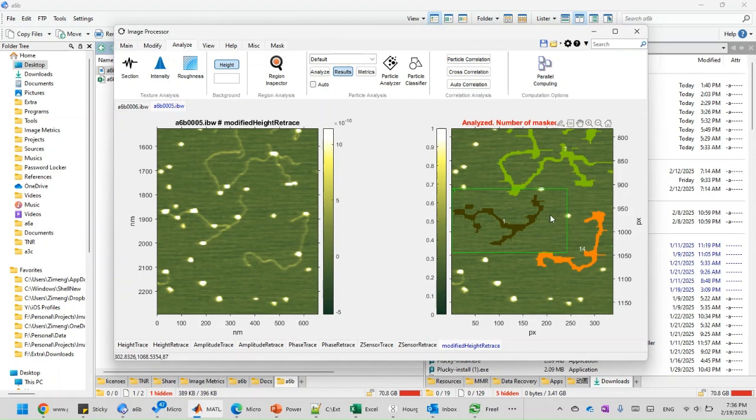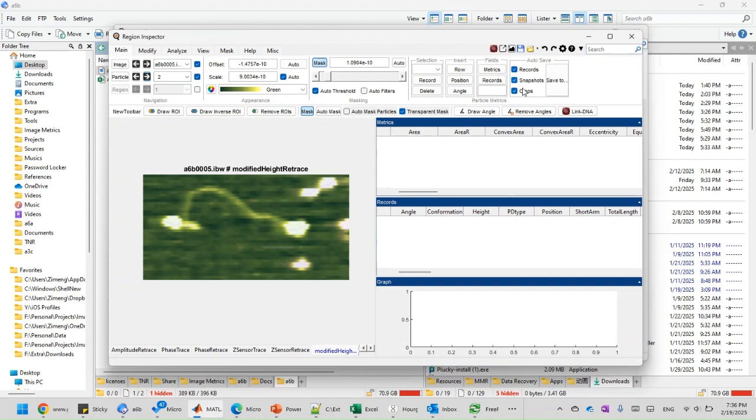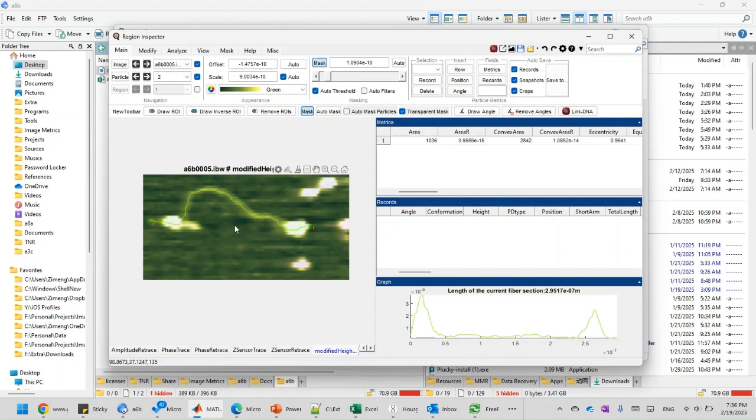So if you have analyzed another particle, let's say the 14, now we're going to make a crop on that one as well, right? As long as you have checked the autosave option, I just checked these crops, it will save those crops in your main image, right? So now we are at particle 2. Yeah, so this one, let's see. I'm going to cover a few additional topics on this one.